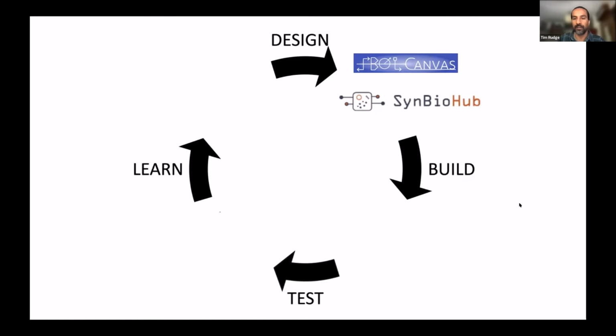Something that we're doing, and that is becoming more common, I think, especially in the biofoundries, is using different hardware for the actual build phase and also the test phase of measurements of these genetic circuits. We're using Opentrons. There are different types of automation systems, essentially liquid handling robots, to do these kinds of tasks, to make this interface between build and test more efficient.